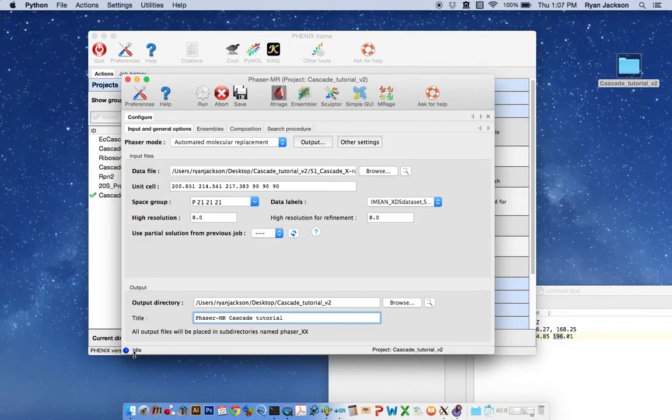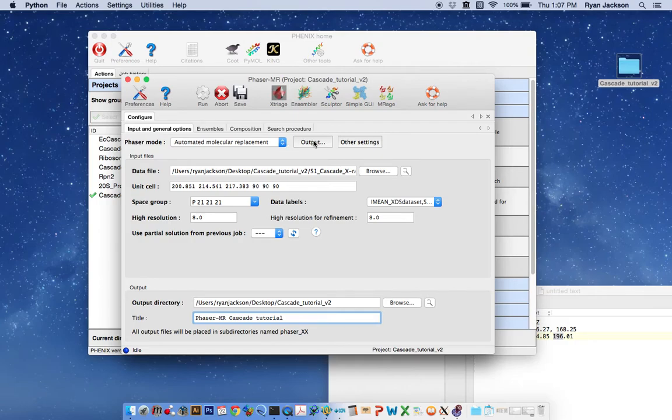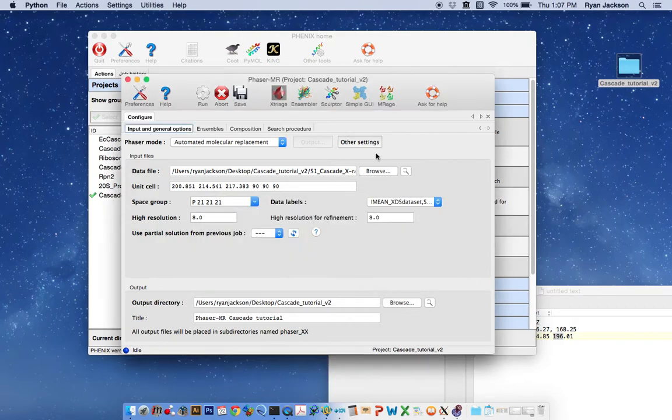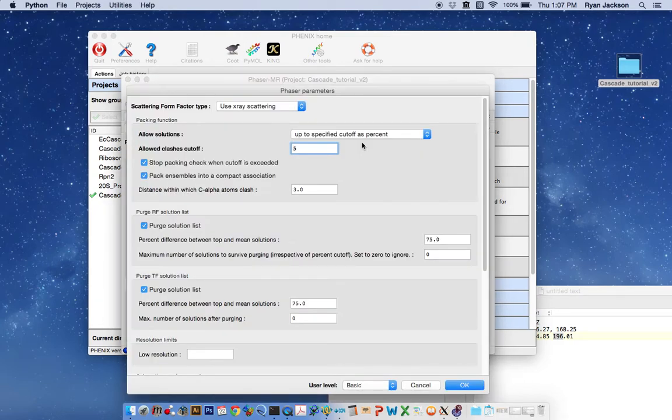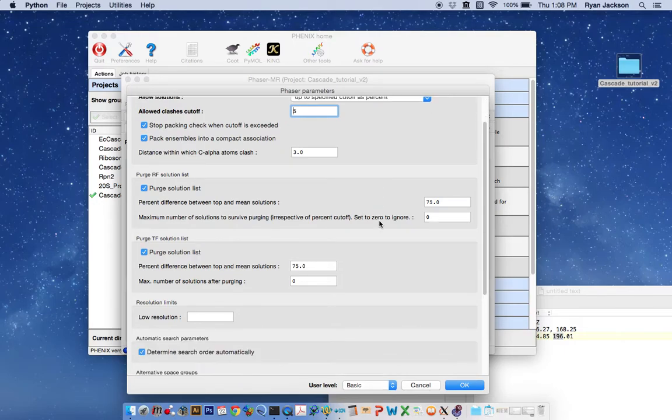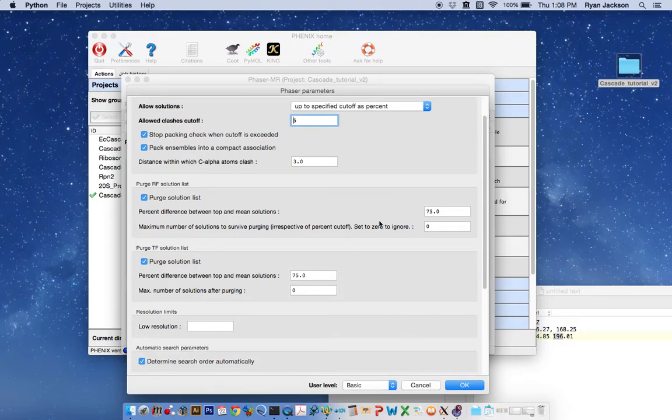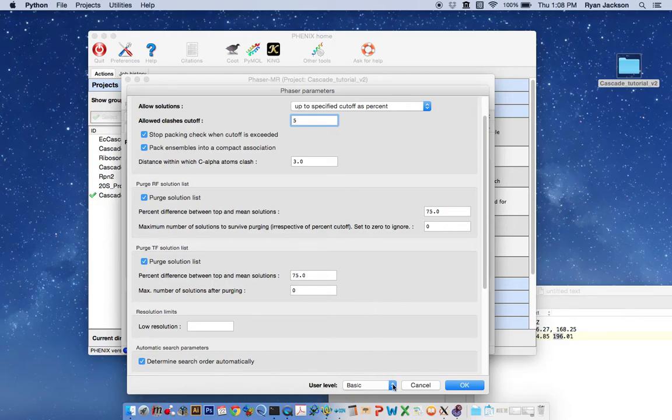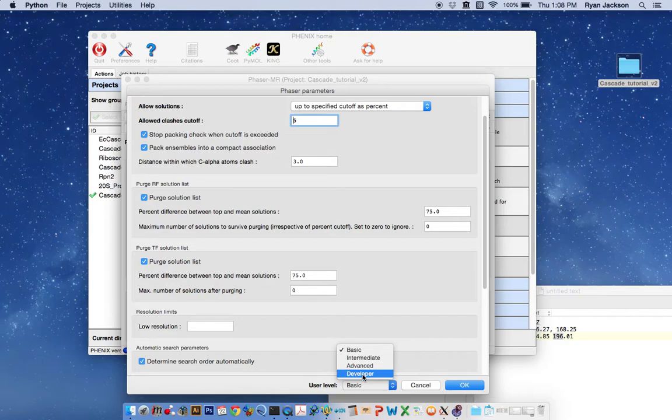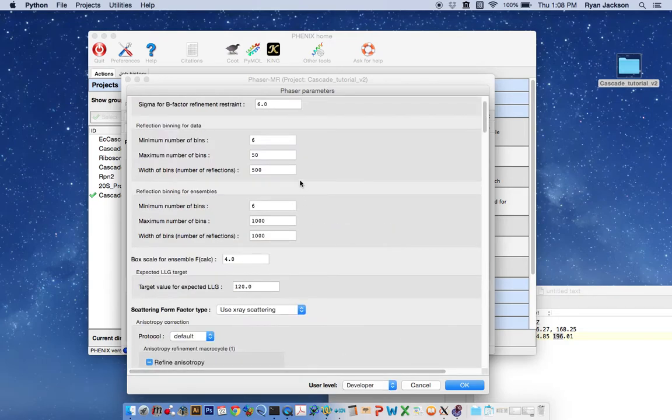Now at this point, we need to modify the phaser run just a little bit because we're using an EM map and what we're doing is accounting for any errors. We're going to go to other settings tool, we're going to account for any magnification errors that are from the EM map and we also want to account for solvent differences in solvent between an EM map and normally what we use with atomic models. So here you just change the user level to developer.